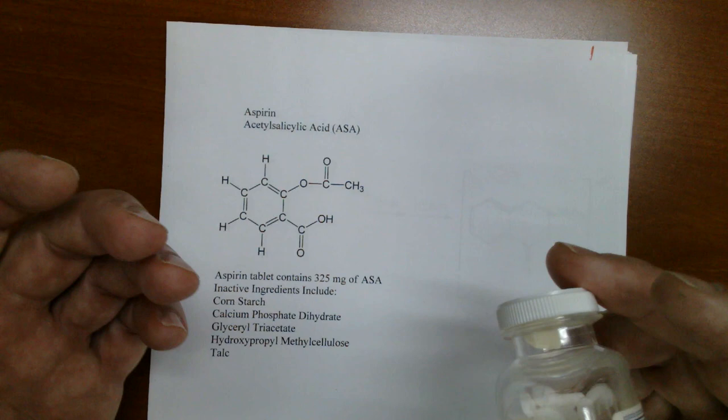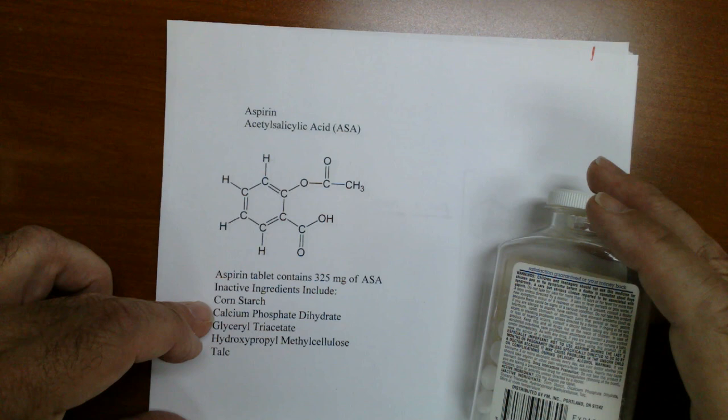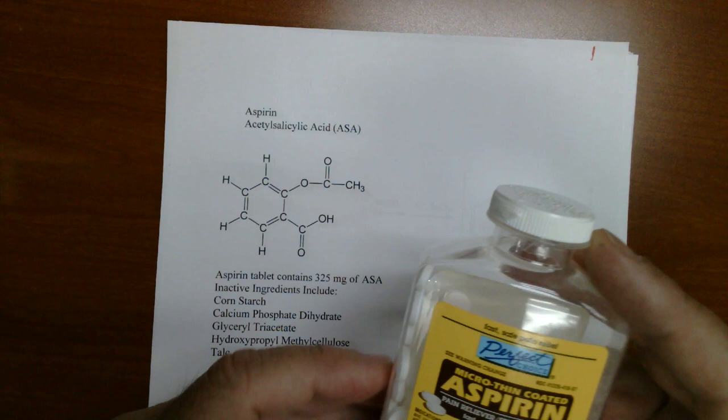And if we look at the label, the inactive ingredients include cornstarch, calcium phosphate dihydrate, glycerol triacetate, hydroxypropyl methyl cellulose, and talc. Okay. So one of our aims for this experiment is to find out the percentage of the active ingredient, the acetylsalicylic acid, in a tablet of aspirin.